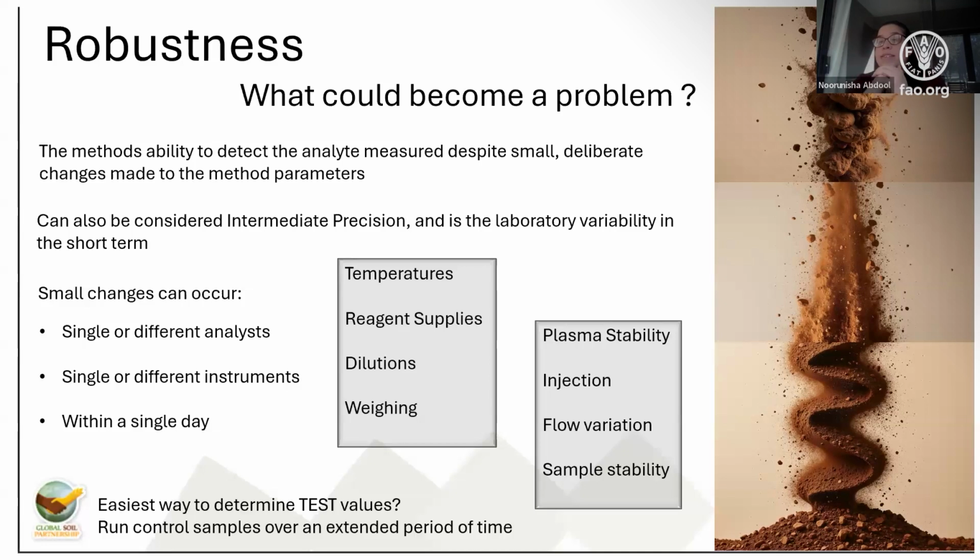All of us load our ICPs and we go home and let the ICP read overnight. In winter, is your ICP room affected by temperature or not? Are your samples stable for the 12 hours that you are there?